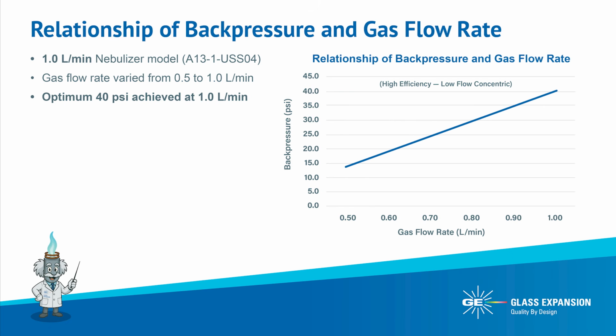Next, we will examine the relationship between nebulizer gas flow rate and nebulizer back pressure. This will help us to have a better understanding of why it is important to optimize the nebulizer gas flow rate. Later, we will evaluate how nebulizer gas flow rate affects the quality of the aerosol.